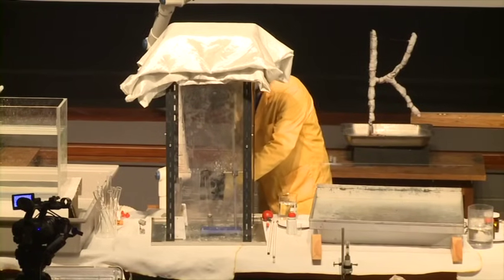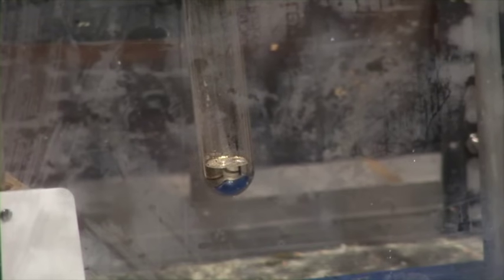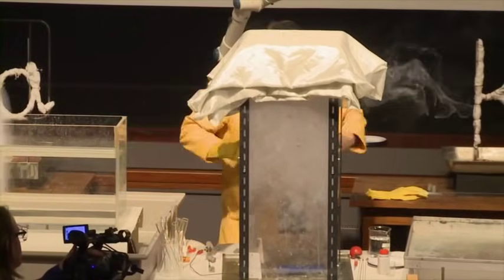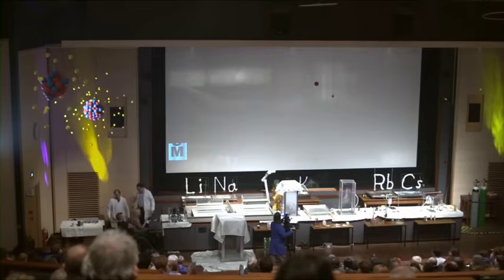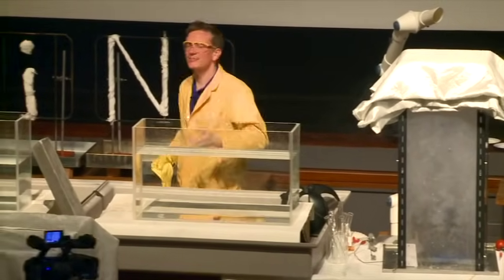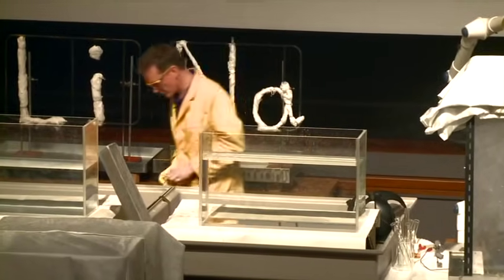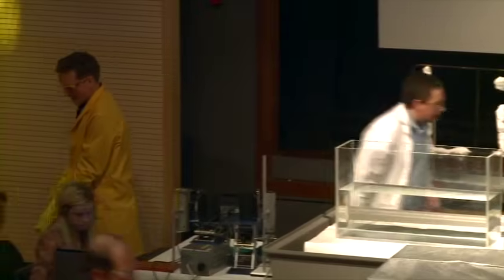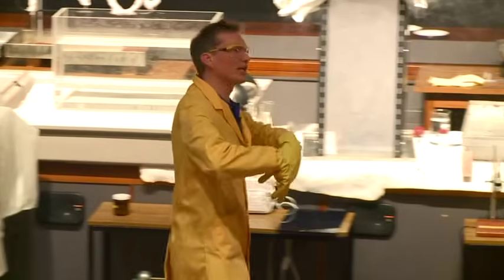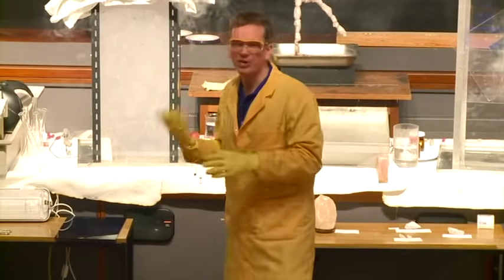Here is our water — and there we go. Not bad. I'm pleased that one's over. Cesium is the most reactive — there's no doubt. It's the most reactive of all the metals and reacts very, very quickly. It's also heavier than water — both rubidium and cesium sink to the bottom of the water, and that's one of the reasons it reacts very quickly.